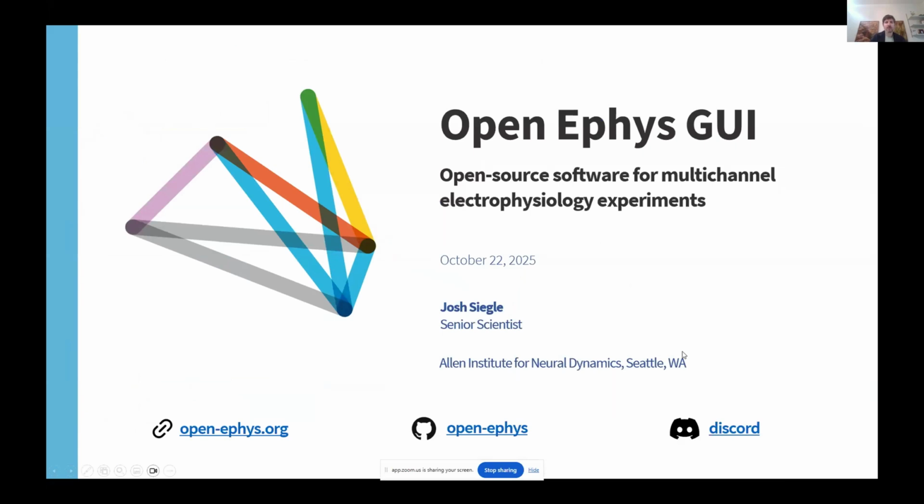Okay, hi everyone. My name is Josh Siegle. I'm a senior scientist at the Allen Institute for Neural Dynamics in Seattle. I'm a longtime Neuropixels user, and I oversee the development of the Open Ephys GUI.